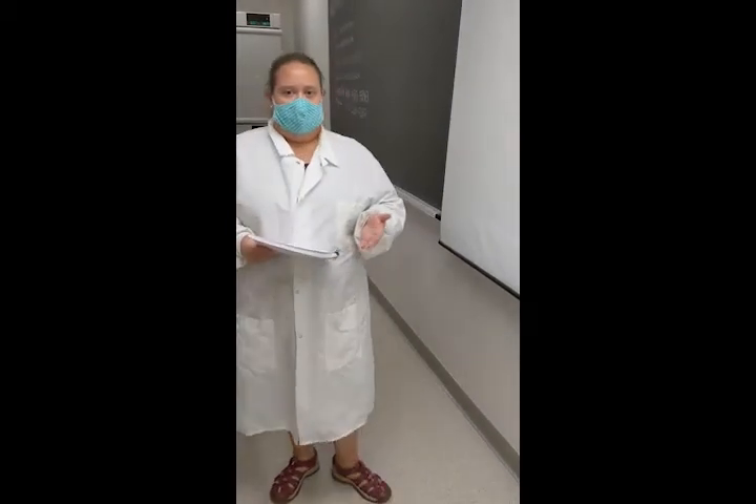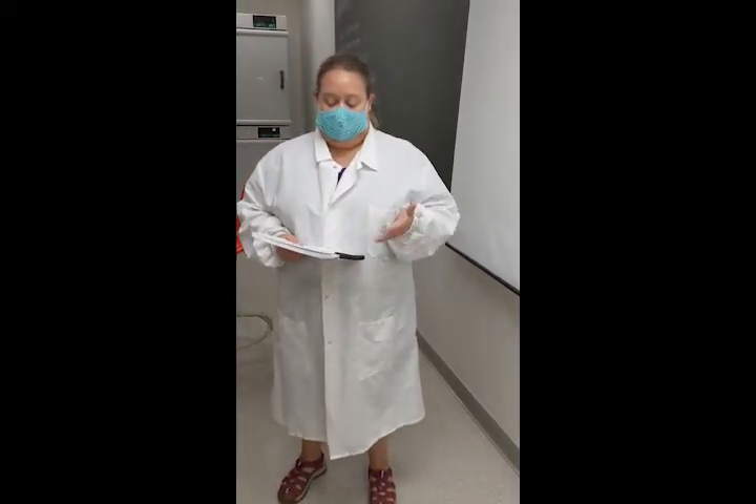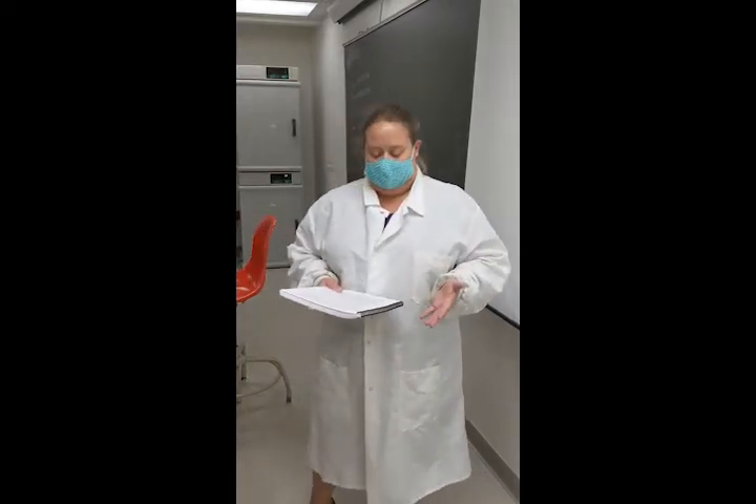We're going to be working with microorganisms in our lab. These microbes are generally non-pathogenic. However, they can cause disease under certain conditions. What we want you to do is learn how to work with your microbes properly and know how to safely handle your microbes.